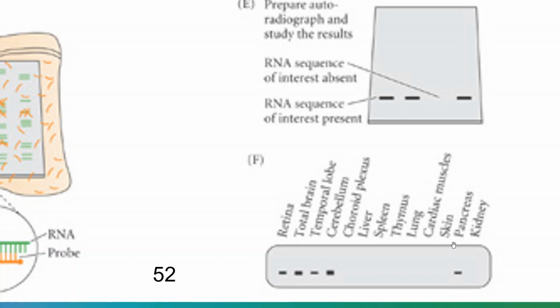But there is no band whatsoever in these tissue samples. There is no band in the lung sample, or the thymus, or the spleen. What does that mean? It means that the gene is not really expressed in these tissues. Okay, so we know a number of pieces of information. We know what the size of the messenger RNA is, which, by the way, represents the exons, not the introns.